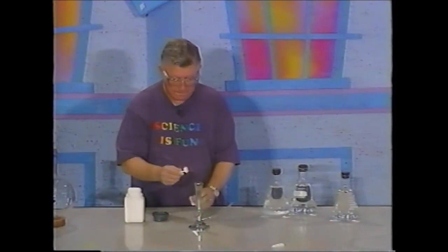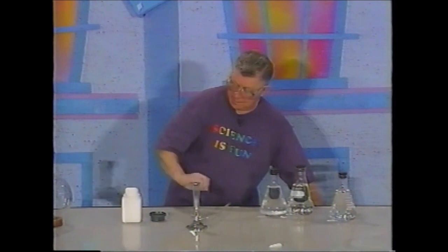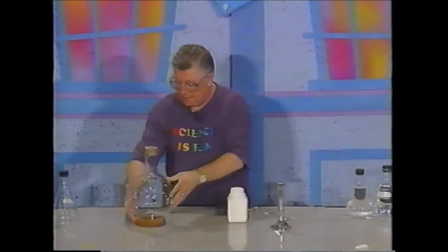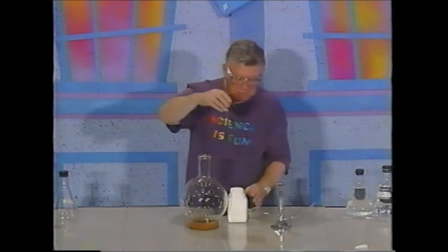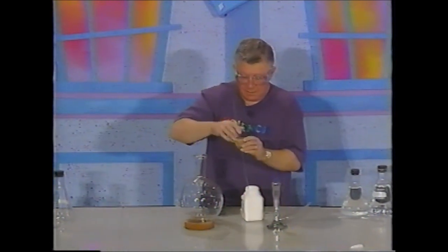And I'm going to burn the sulfur, and when sulfur burns, it forms sulfur dioxide. And this will happen by my taking this cork off. It has a spoon at the bottom. I'm going to fill this spoon with the sulfur, just like that.